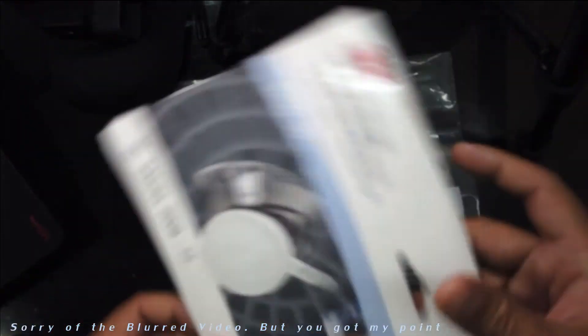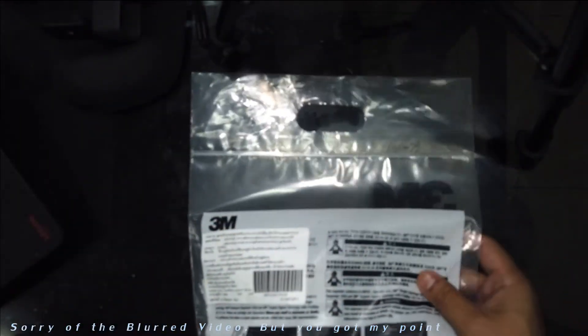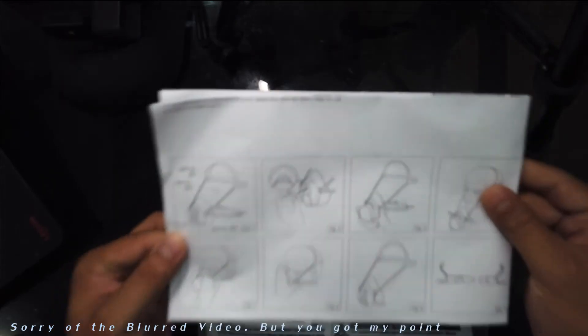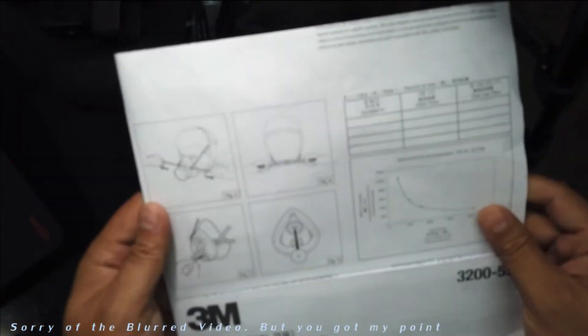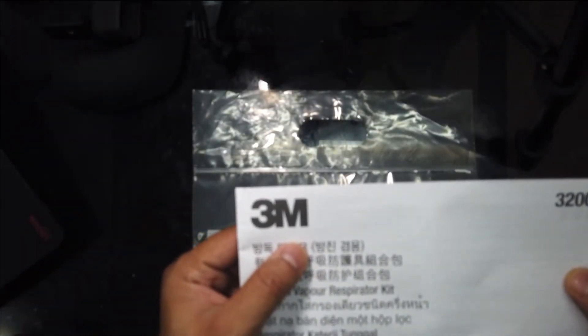I have taken out the cover and set it aside. With this kit you get a manual in multiple languages. This is a 3M mask — 3M is a company licensed by Canada, a Canadian company. There is a big manual covering everything including how to use the mask, but let's go to the material itself.